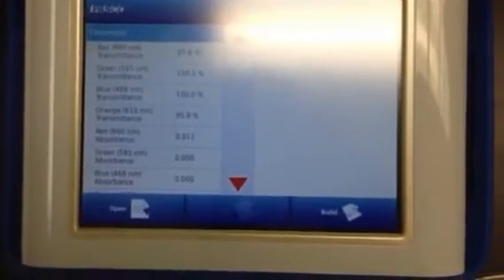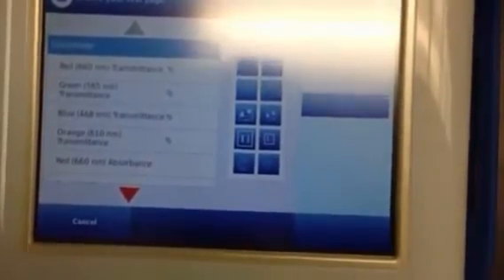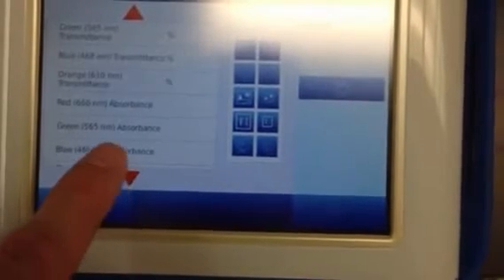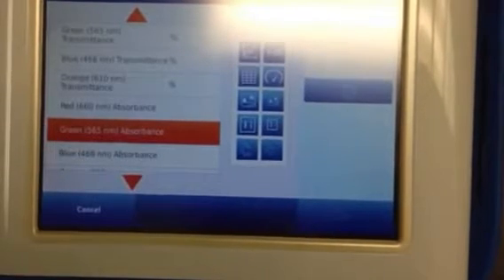It's going to ask you what absorbance or transmittance wavelength you want to use. First, you want to build a file — click on the lower right-hand button that says Build. Now I know the directions say 592 nanometers, but I want you to pick 565 for the green wavelength. We're picking green because the complementary color to violet is yellow, but we don't have yellow, so green is the next closest thing — or you might say green is the maximum absorption for violet.